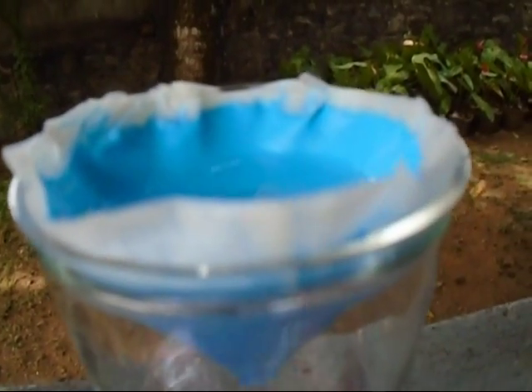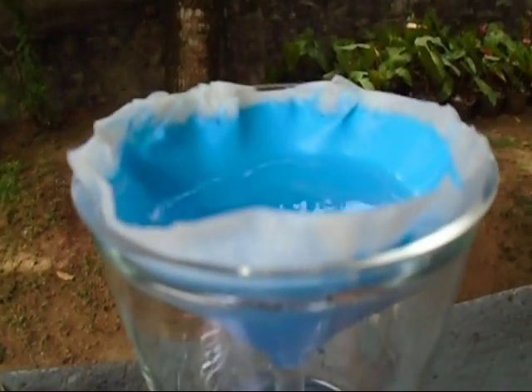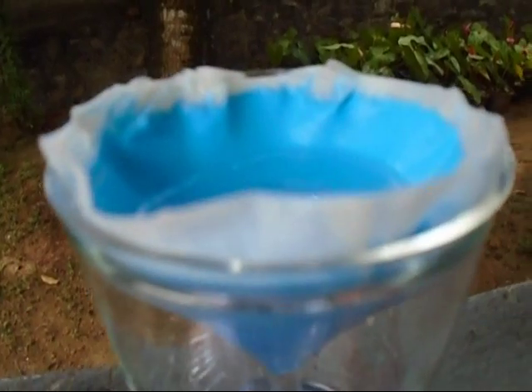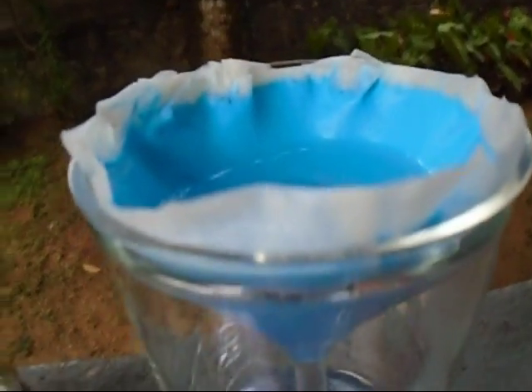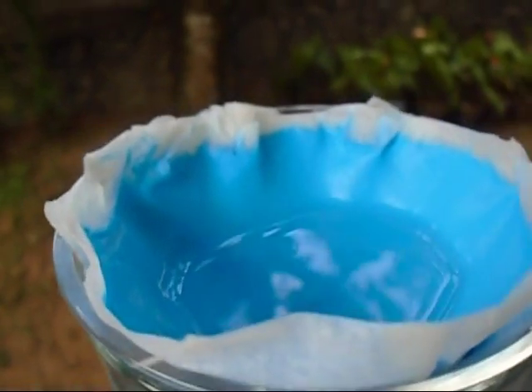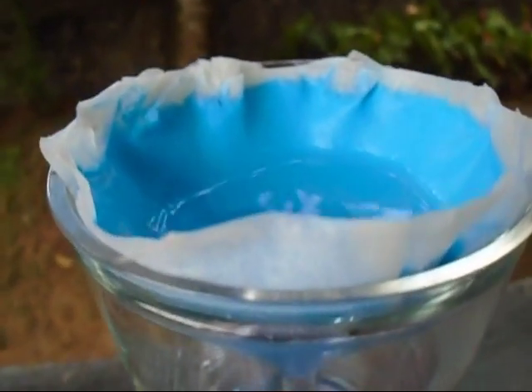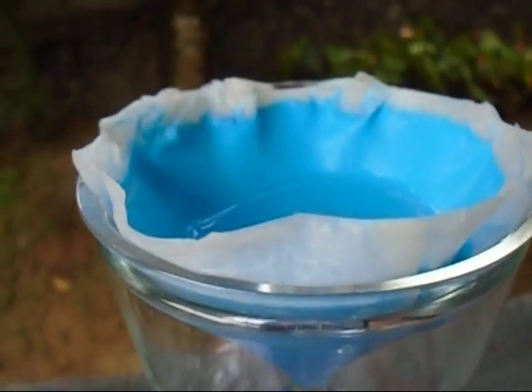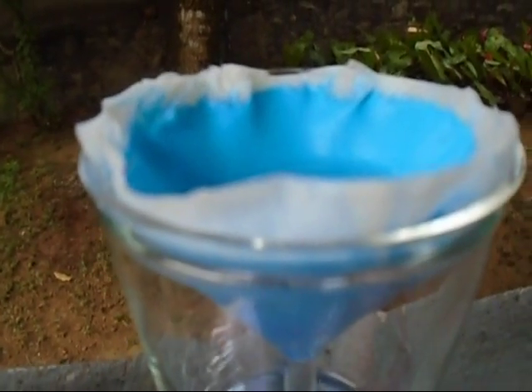We can wash this copper hydroxide a few times and then dry it. Do not heat the mixture because copper hydroxide will decompose to copper oxide and water. We will use this copper hydroxide in a future video to make copper oxide.